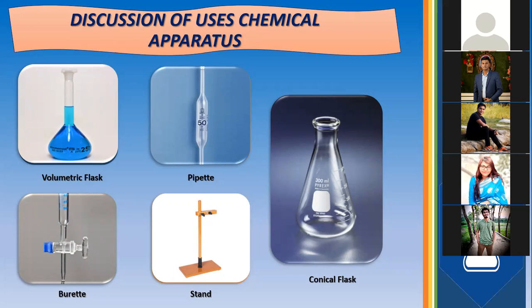The second picture is a pipette. The pipette is a tube with two open mouths. Its two ends are turned into narrow tubes. The result is a thick tube, light, but in the middle it is called the bulb. The upper part of the bulb is surrounded by a red mark. This mark indicates a certain volume.